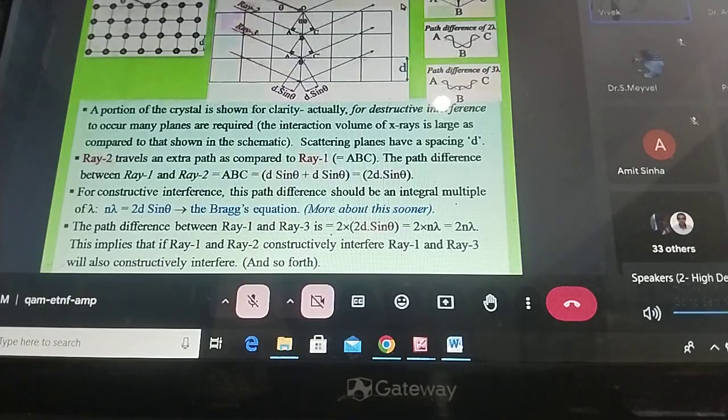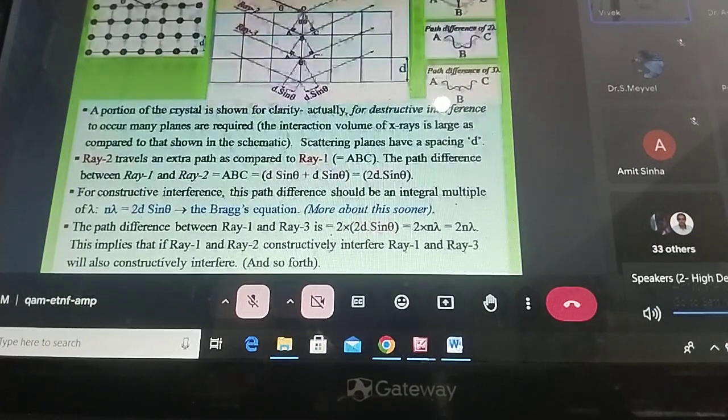So all information is contained in this scattered radiation. How we calculate it is up to us, our expertise: we have to extract whatever we can from this data. Our input is only this, what has been scattered; all the information is captured in it. How you extract it is your expertise.